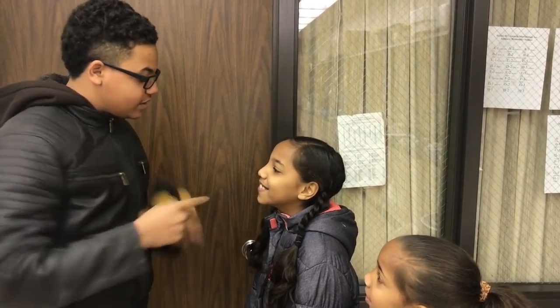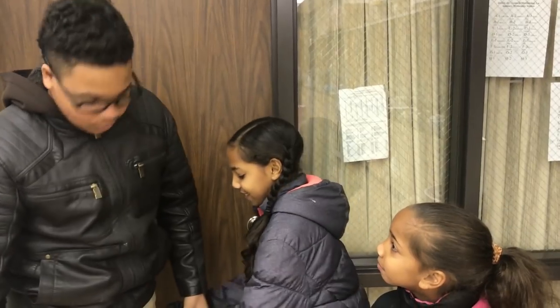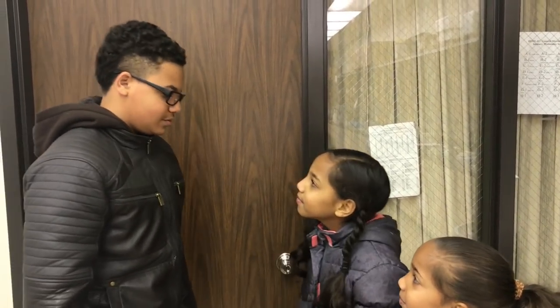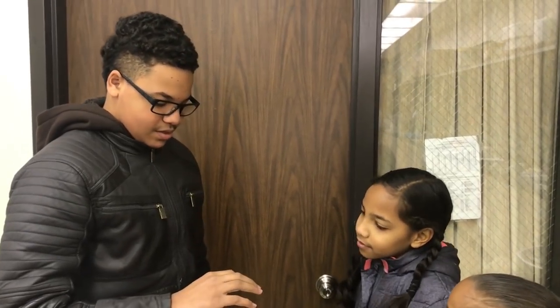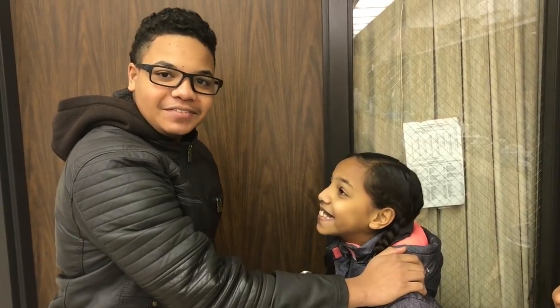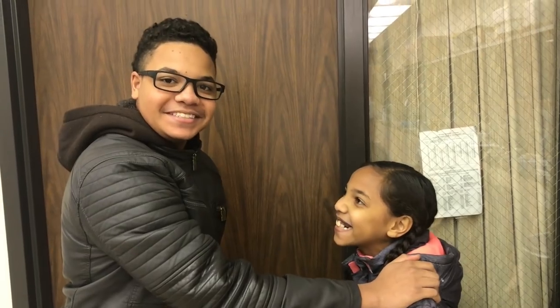There's obviously Staph on you. Also, there's a lot of species. The most common ones are Staph aureus and Staph epidermidis. We're testing Staph aureus. Staph aureus is definitely worse than Staph epidermidis.